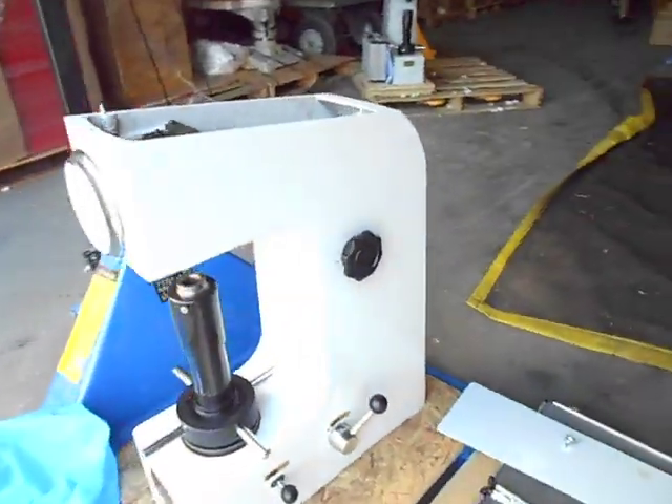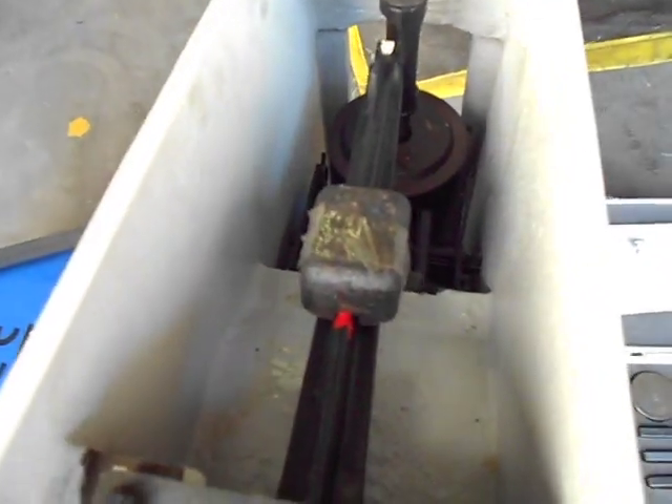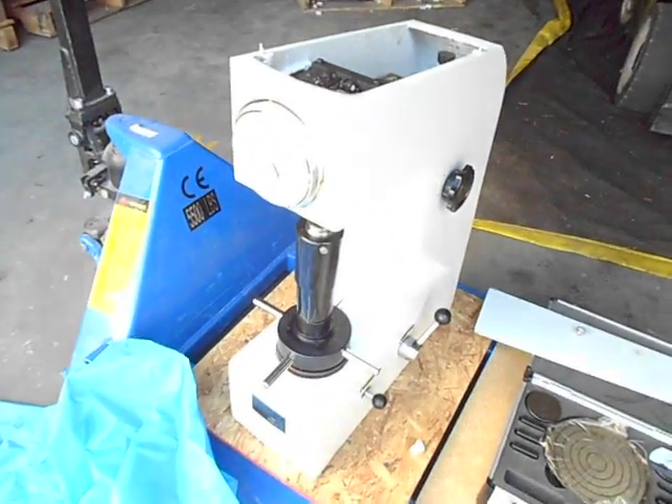The dial didn't seem to move when we put it to test with the standard. It's also got some tape here that might have been from the factory or the original recipient of the machine. Anyway, it's up for parts or repair, as is. No reserve auction.